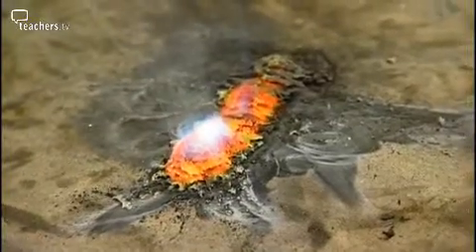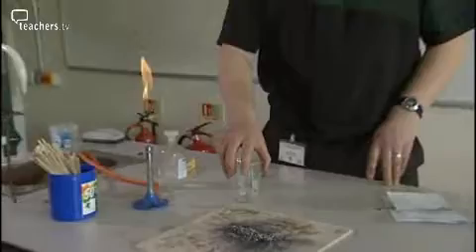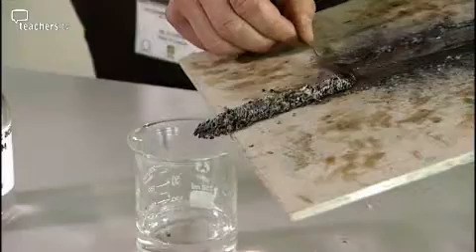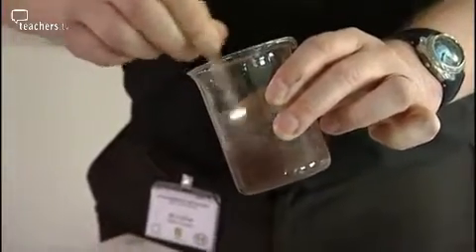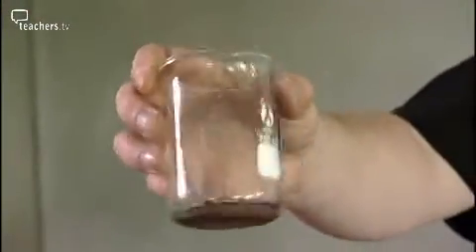Oh, it's puffy! Once the students have allowed this to cool for a few moments, what we can do now is to look for the copper. Take a beaker and some 2 molar hydrochloric acid. Slide the reaction carefully into the beaker. The acid will react with the zinc oxide that's formed, and we should see fairly quickly the brown colour of the copper coming out. Carefully pour away the acid, and that leaves the copper in the bottom of the beaker.